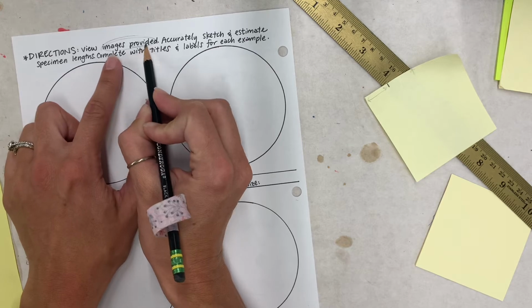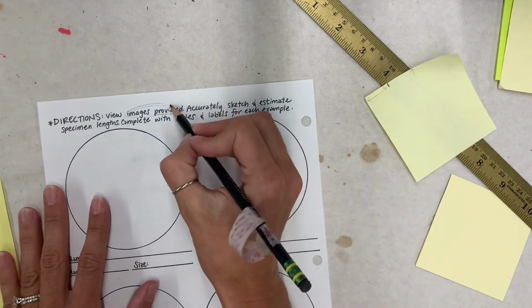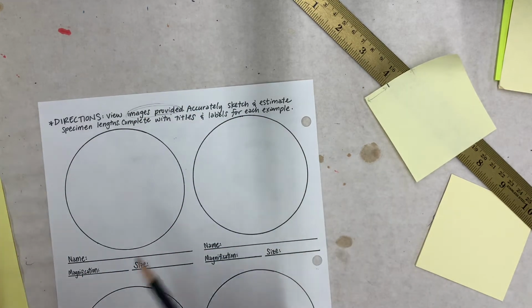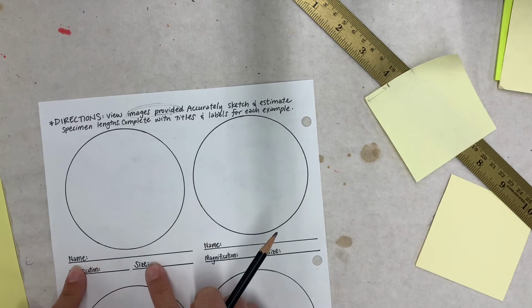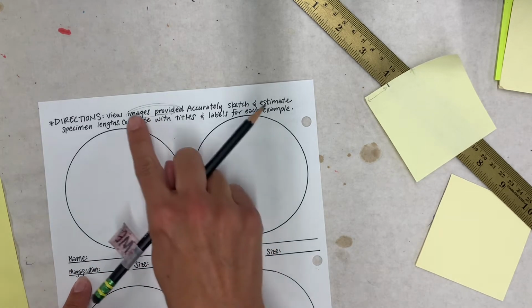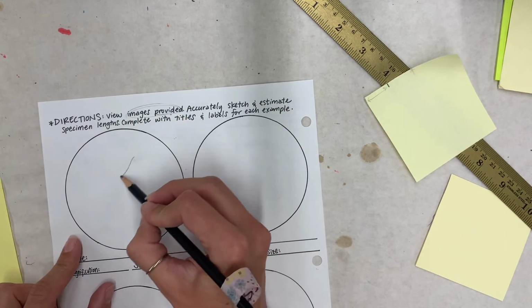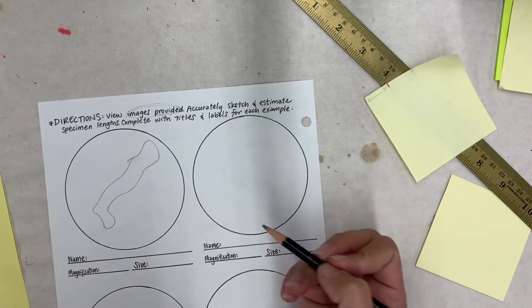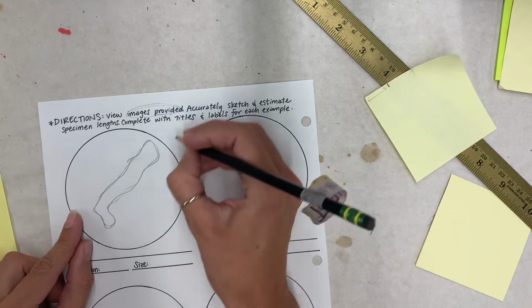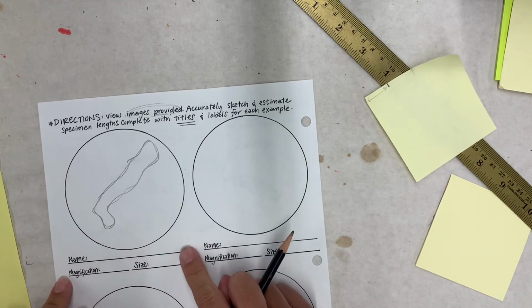So these images might be provided in class. They might be provided on Google Classroom with a Google slideshow. But however the images are provided, make sure you include the name of the specimen, the magnification, and the size. So you're going to draw what you see as accurately as possible. Let's say your specimen looks like this. Don't copy that. But let's say this is our specimen. You're going to draw accurately. Use colored pencils. You need to include a title, which should be provided for you.